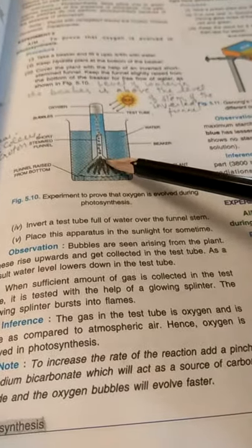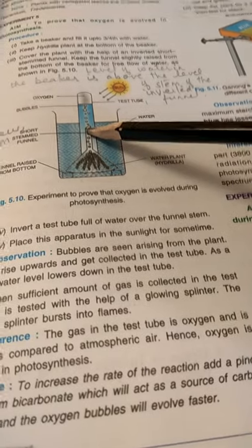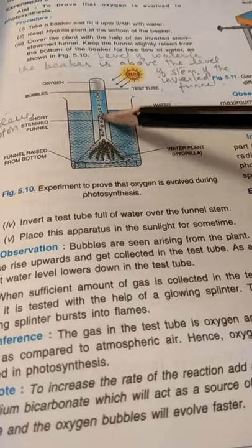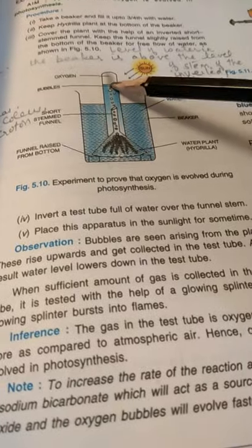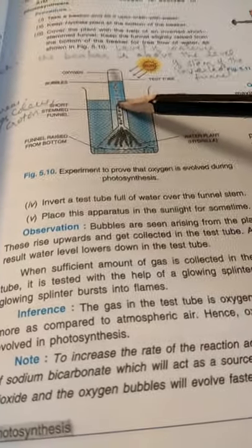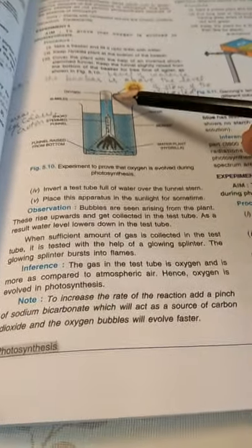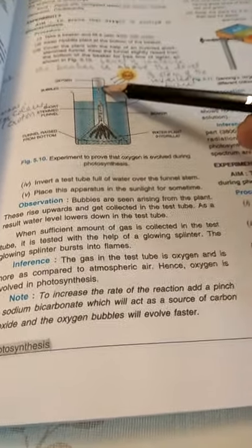We'll keep this setup in the sunlight for some time. After some time we will observe bubbles of air being produced and rising up into the test tube on its upper side. The bubbles rise from the plant through the stem of the funnel and are collected at the upper end of the test tube. To give space to the bubbles, the water level falls down in the test tube. When sufficient gas is collected, it is tested with a glowing splinter.